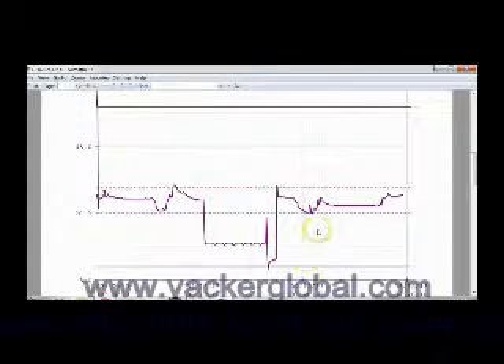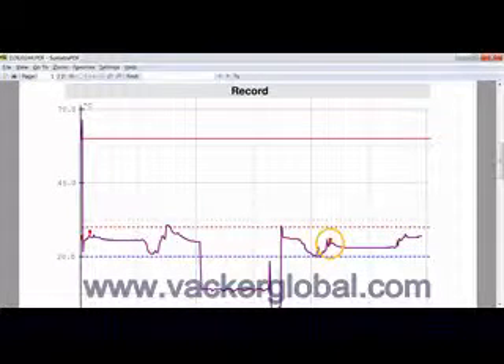You can specifically see the points where we applied hot air and those inside the freezer. The majority of the remaining duration was at room temperature. You can also see the benchmark set by pressing the start button.